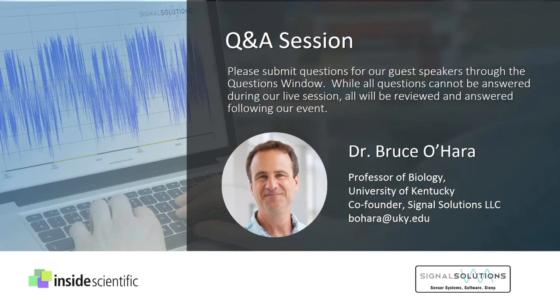Several people, including Heather, have asked if it's possible to measure sleep-wake breathing using a system like yours in group-housed rodents. Okay, yeah, that's something we've been interested in too, and we're still evaluating that. In general, mice tend to sleep together and wake together, so you can certainly get a general, accurate outline of when your grouped animals are sleeping and when they're awake.